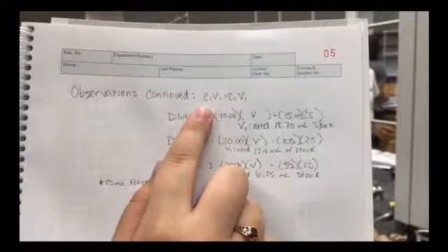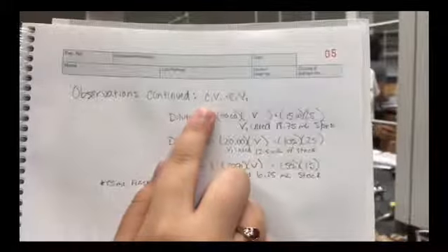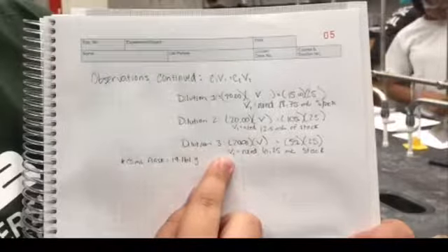We will be using the C1 times V1 equals C2 times V2 equation during our 3 trials today to find the concentration of a diluted solution. The C1 represents the concentration of the original stock solution, 20%, and V1 is what we must solve for. It represents the volume of stock solution we must begin with to reach our desired percent concentration for each dilution, whereas C2 and V2 represent the concentration and the volume of the diluted solution.